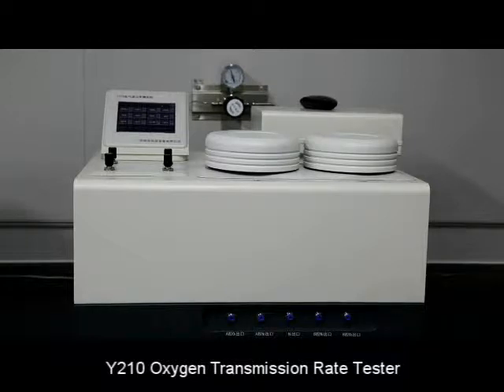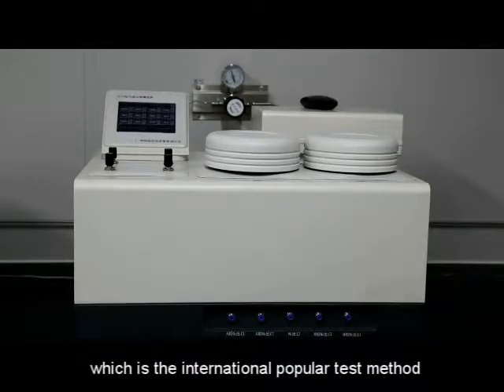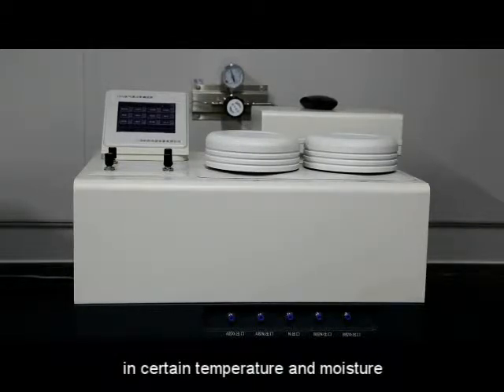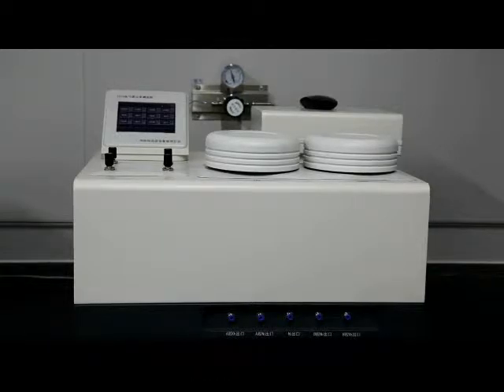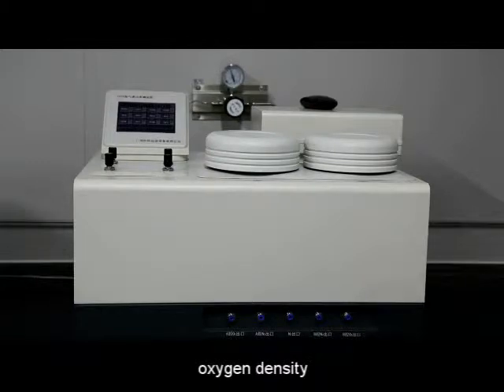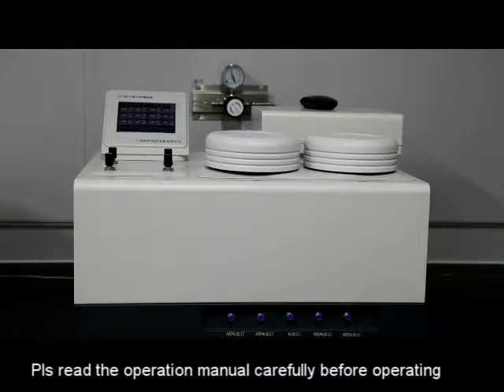The Y210 Oxygen Transmission Rate Tester adopts the coulometric method, which is the international popular test method. It is able to test the sample continuously in certain temperature and moisture. It currently shows the transmission rate, oxygen density, temperature, and moisture as four curves. Please read the operation manual carefully before operating.